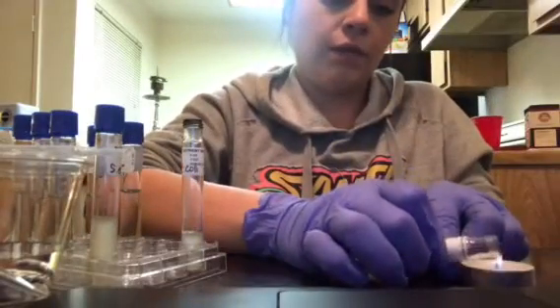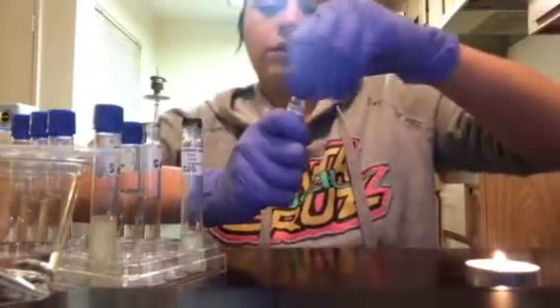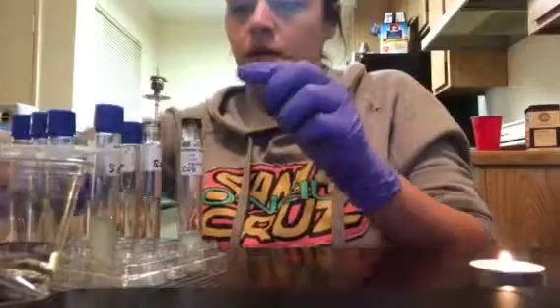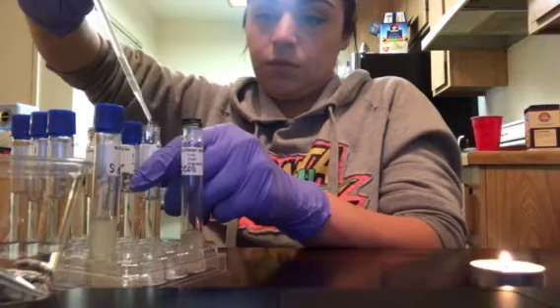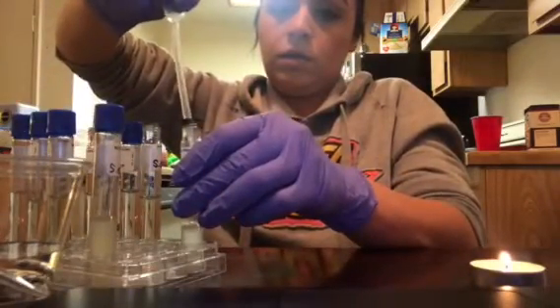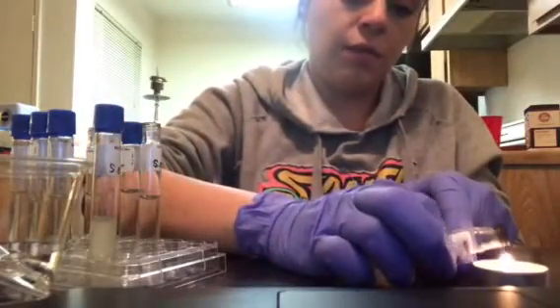So this should go by fairly quick. So flame that, and while we're at it, I'm just going to flame the 15% tube as well. Flame that, and then same thing, I'm going to drop 2 drops into each one, just like that. And then it says to place this back into the alcohol. And then before I cap the tubes again, I'm going to flame them.